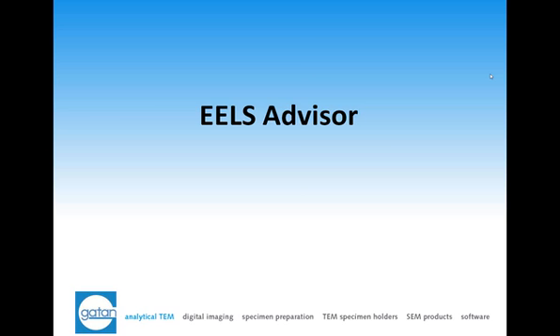So during the course of this week at the EELS School, you will have come across a number of situations that have prompted a number of very important questions with respect to EELS microanalysis. The issue of how much of a particular element and a particular edge is detectable using EELS arises, as well as what the dose and acquisition time constraints are for detecting a particular edge.